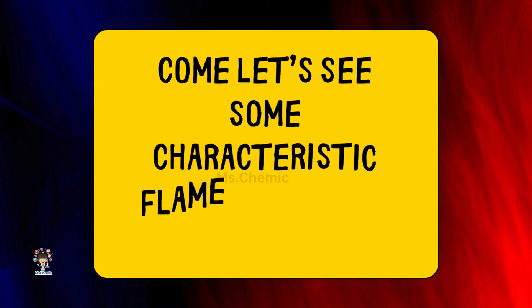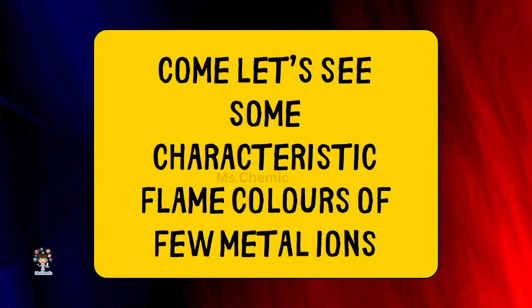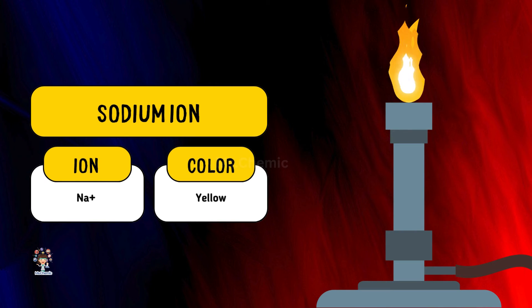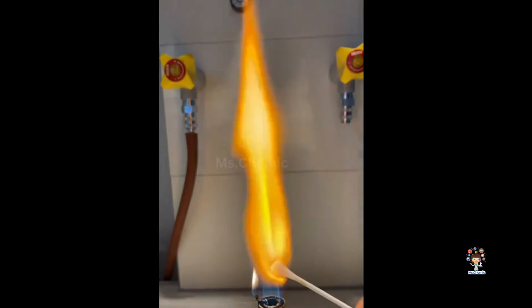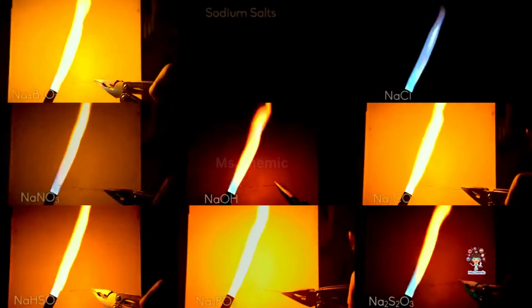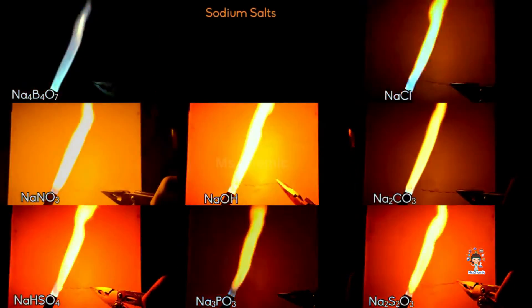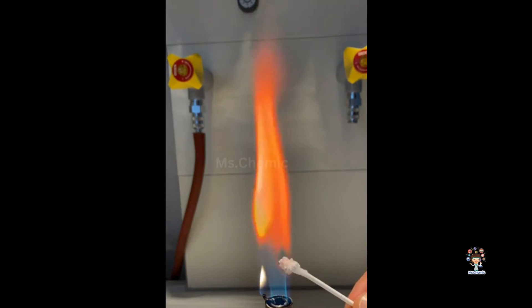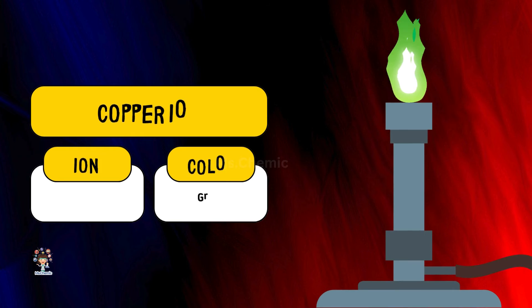Come, let's see some characteristic flame colors of a few metal ions. Let's see some of the elements.